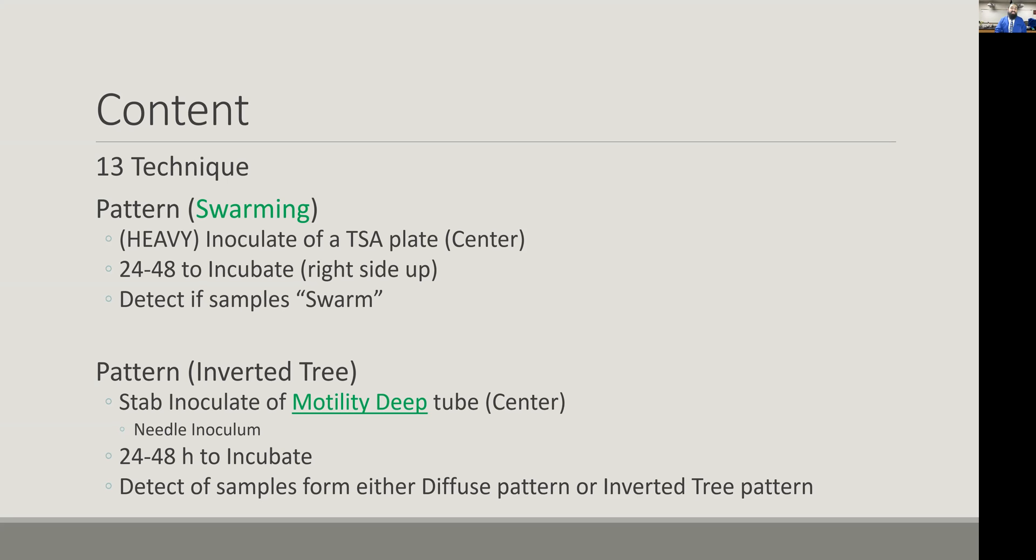If the organism can move—if it has true motility—it will move in very unique patterns. It grows for a small amount of time, creating a large colony, then it travels outward from the center, stops again, grows, and travels again. It repeats this several times until it looks like waves of growth and motion. This pattern of concentric circles on a TSA plate is called swarming.